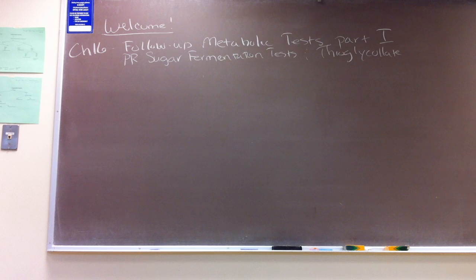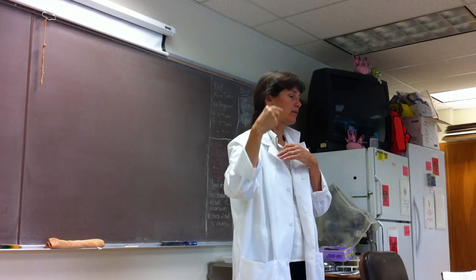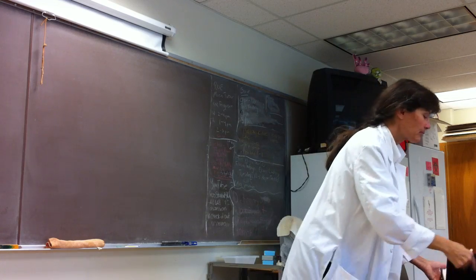When we say pull, you guys, that's just the jargon that we use, meaning that you go and retrieve your cultures from the incubator. That's what we mean by pull. And do remember, you want to be careful not to shake your tubes, because with the thioglycollate you're going to be reading the pattern of growth. So you don't want to shake the tubes before you get them.